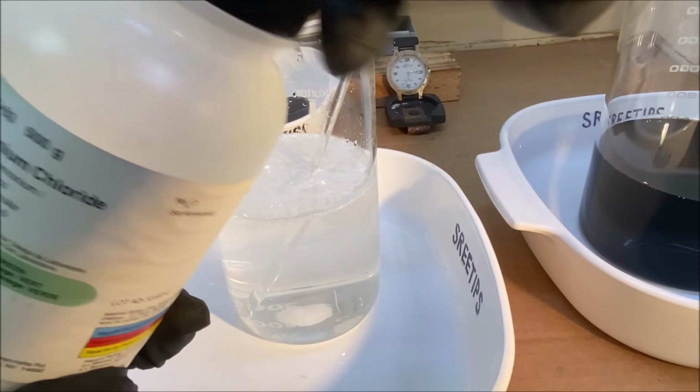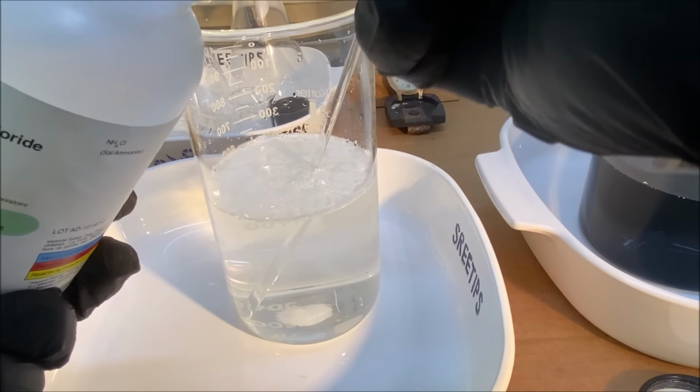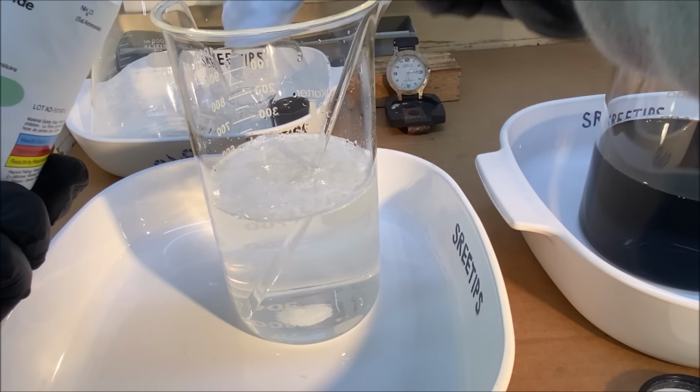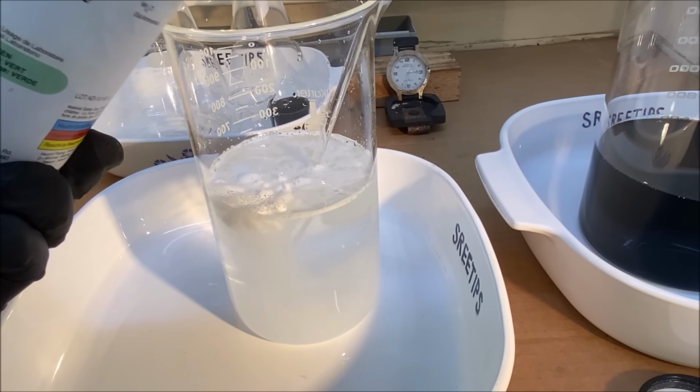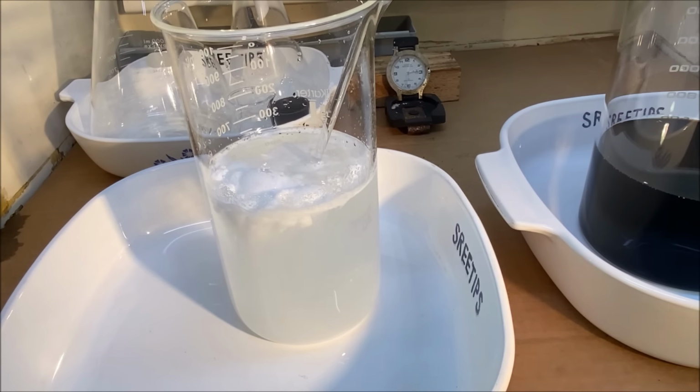The book said to make a concentrated solution, so I'm going to add a couple more spoons of ammonium chloride just to make sure we've got a nice concentrated solution of ammonium chloride.